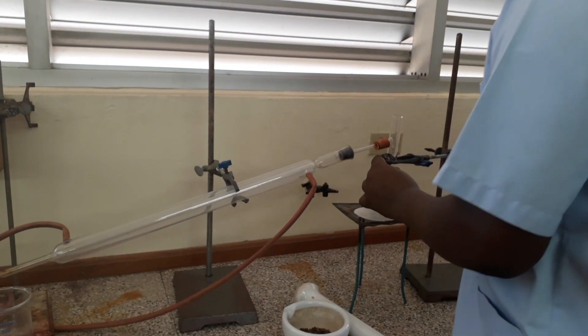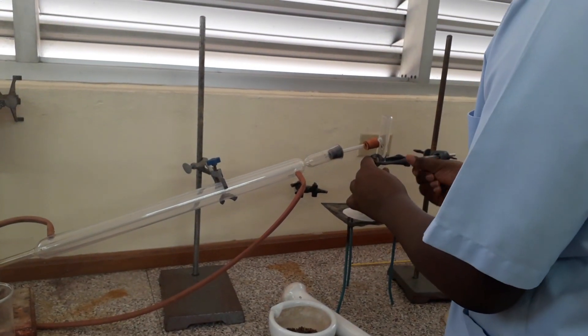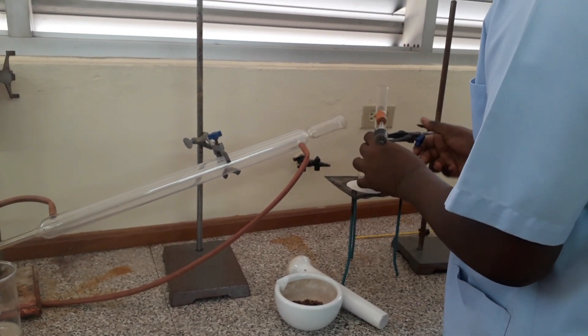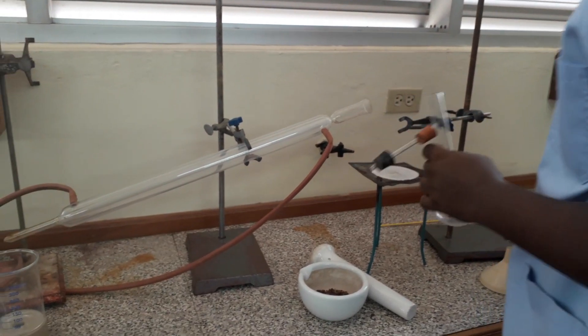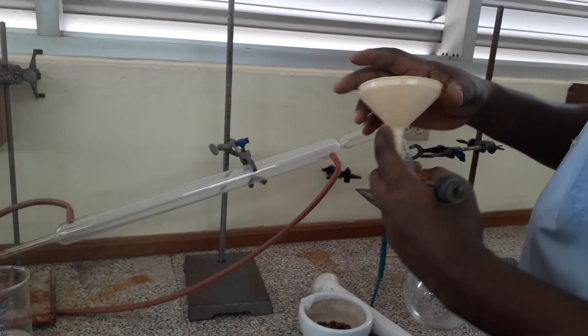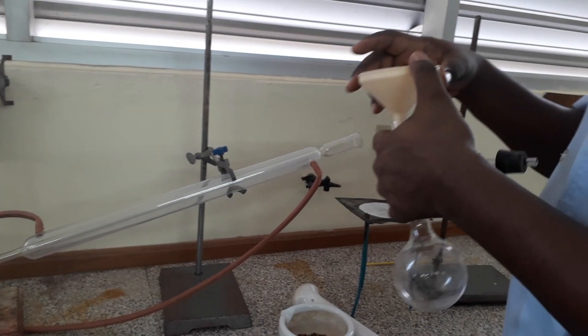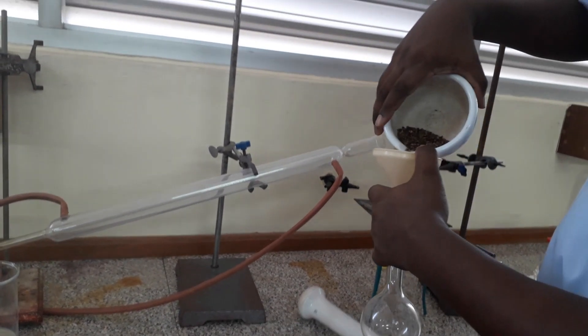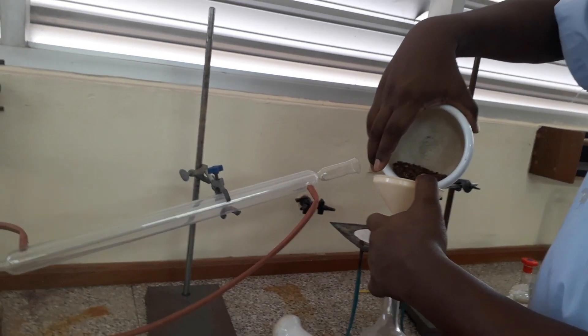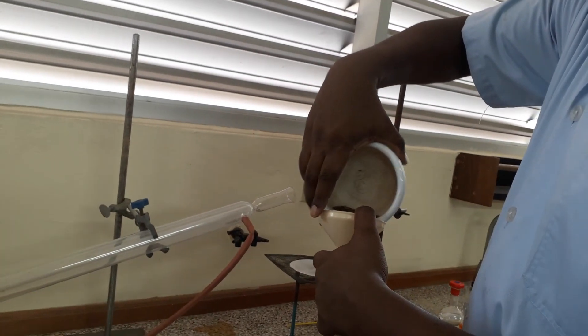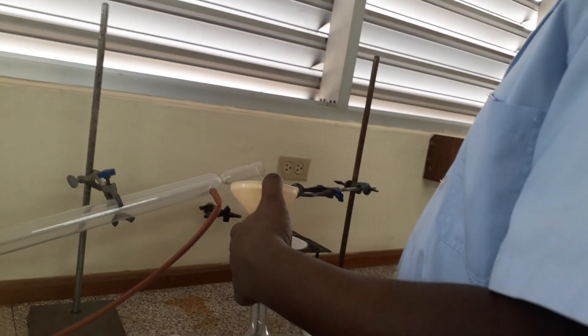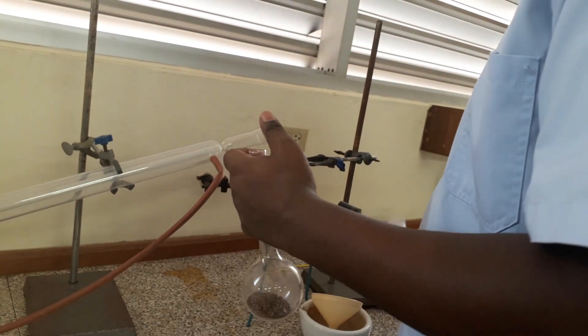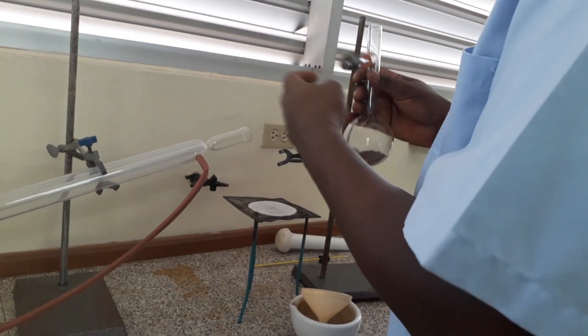So now I'm going to put the crushed cloves into my distillation flask. I'm going to use a funnel and try to make sure that it doesn't go down into my distillation flask.